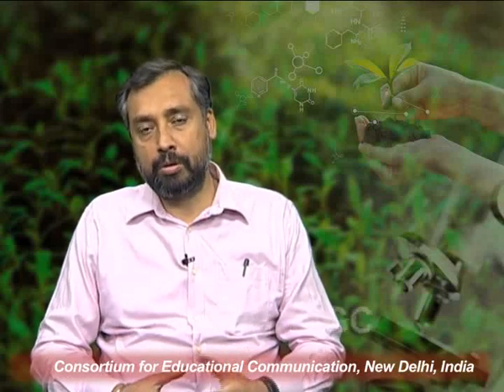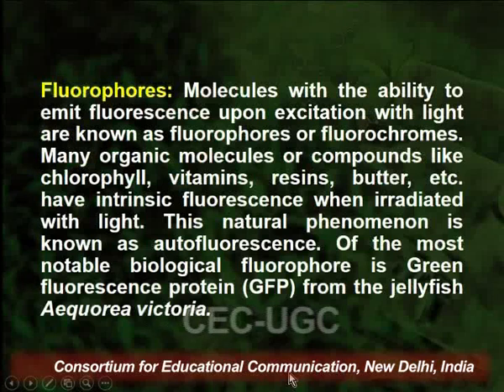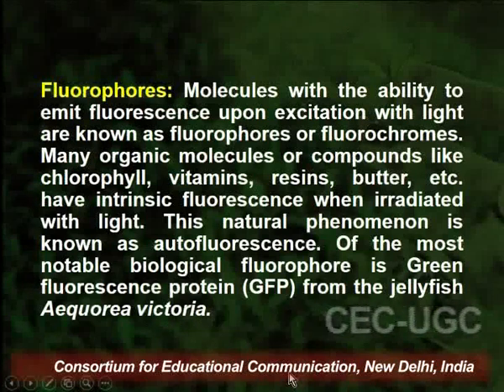Now, of the most notable biological fluorophores which is used to stain any kind of cellular structure, green fluorescent protein or the GFP is the most common one, which is obtained from the jellyfish named Aequorea victoria.